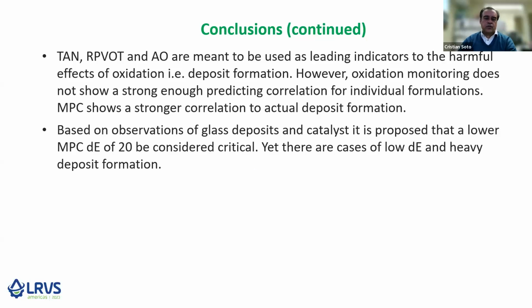It is proposed also in this presentation that the MPC critical level be dropped to 20 ΔE, as we see in many cases that the MPC level can be quite low, and one can still be detecting the formation of deposits.